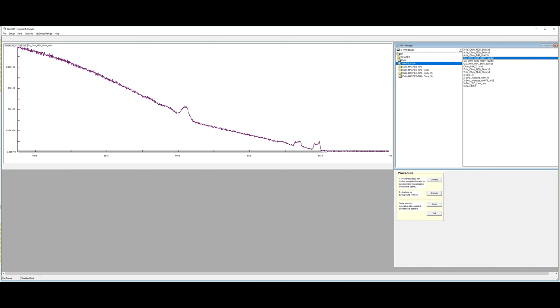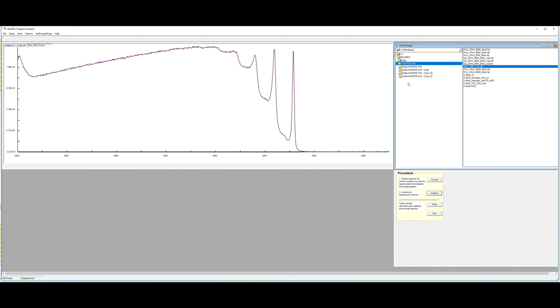The spectrum is here, titanium. So this is titanium 1s from this sample, taken at a photon energy of 8,000 electron volts. Here's the peak. These are plasmon structures, and here's the background. So now we analyze that.